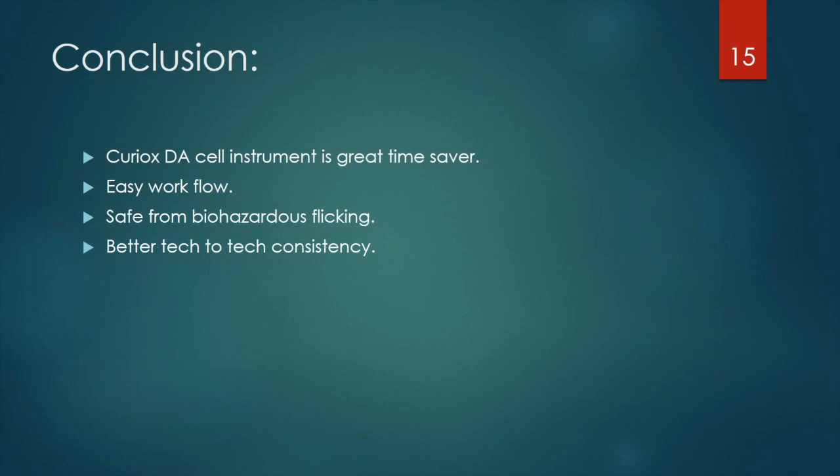And regarding IgG FITC, the titrated concentration is very crucial. Using a high concentration of your goat anti-human IgG FITC will cause very high background. So you have to optimize and use it as diluted as possible to get proper results. So thank you very much, and I'm ready to take your questions if you have any.